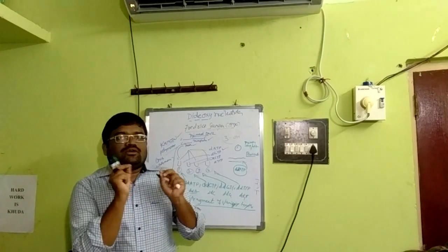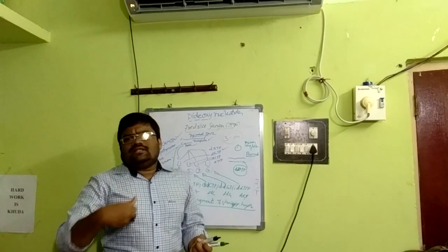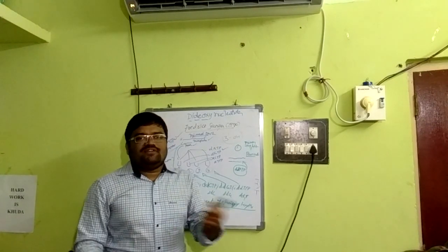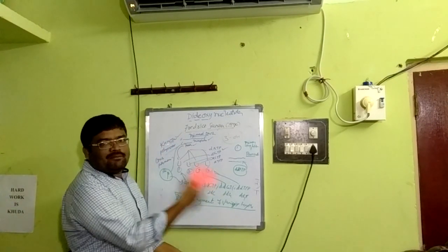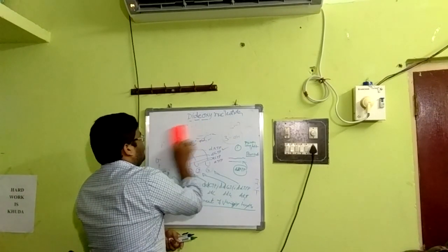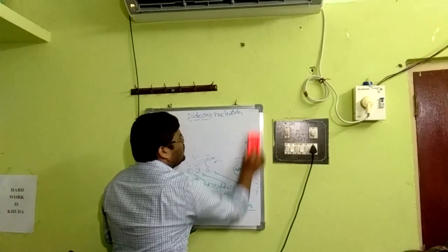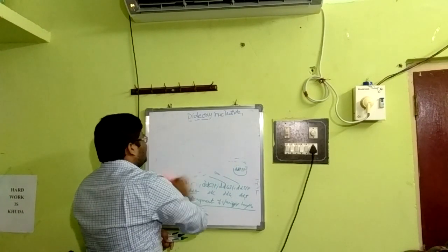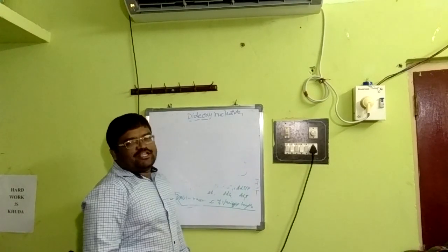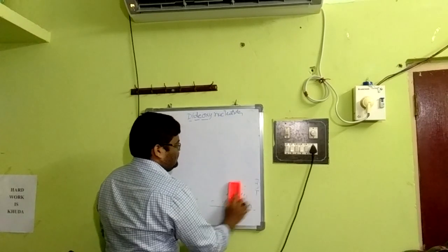There will be a technique to understand and to determine the sequence. The process is the same: electrophoresis and through autoradiography we can determine the sequence. How we have to determine the sequence is very important. So it's about the basic working mechanism of dideoxynucleotide sequencing. I told you already, when the dideoxynucleotide comes into action, the chain termination will be done. That is why it is otherwise called the chain termination method.